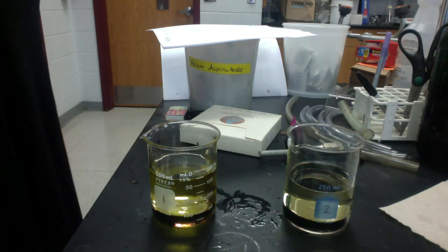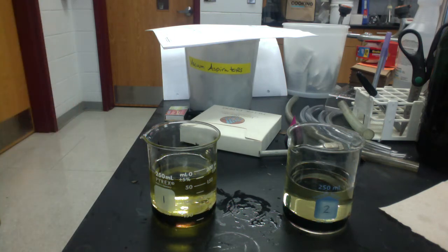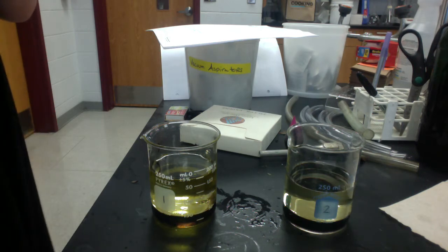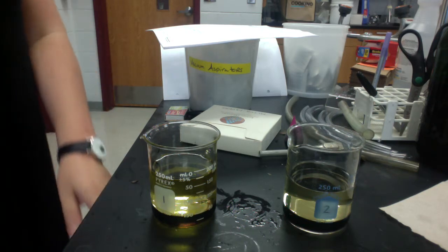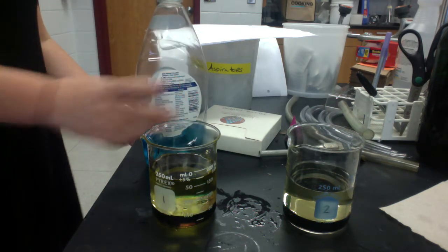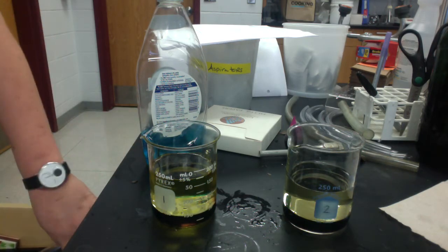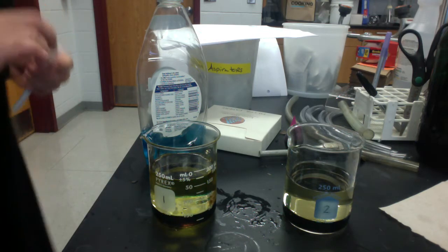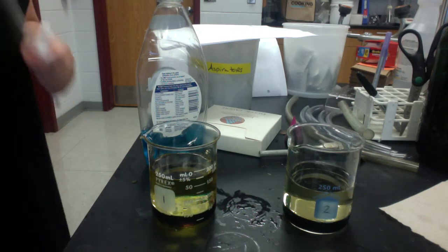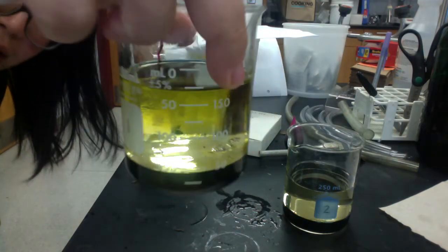Next, add some dish detergent to beaker 1 and stir vigorously. What do you see? So I'm going to use this dishwashing liquid. It might mean something else, but I don't know. So that is what I'm going to do. Let me find a stir rod real quick. Straws will work. Alright. Let's see here. So now the dyes are here.